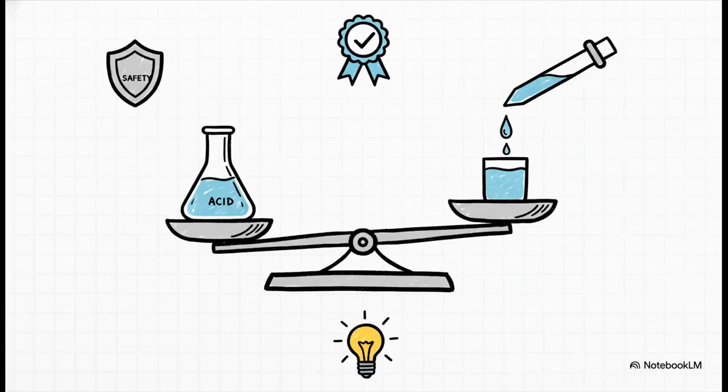So, if there's one thing to take away, it's this. Titration isn't just some random lab experiment you do in school. It's a fundamental, incredibly precise chemical balancing act that is essential for ensuring the quality and safety of things we rely on every single day.